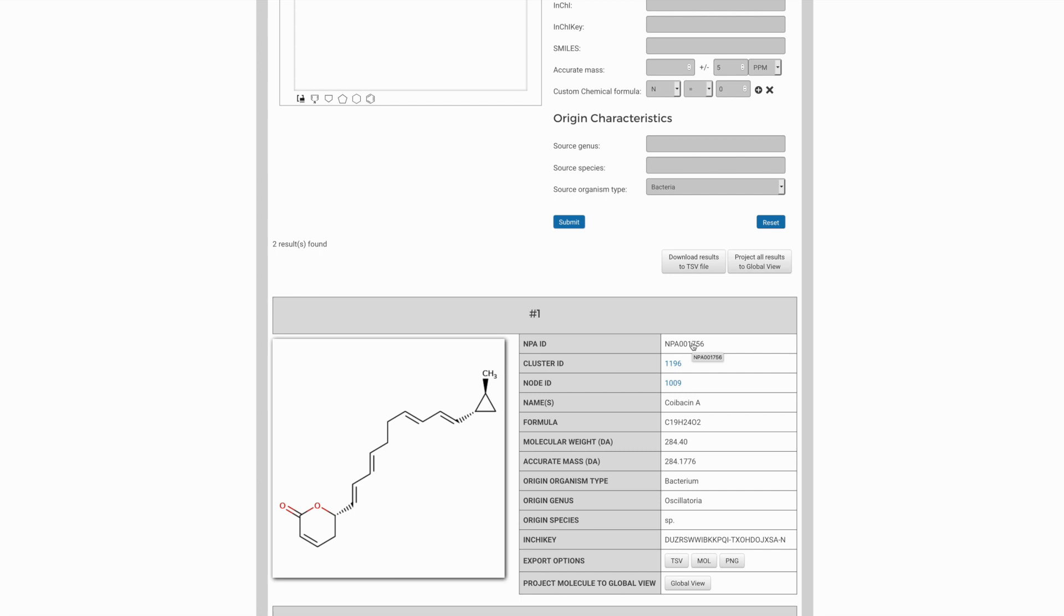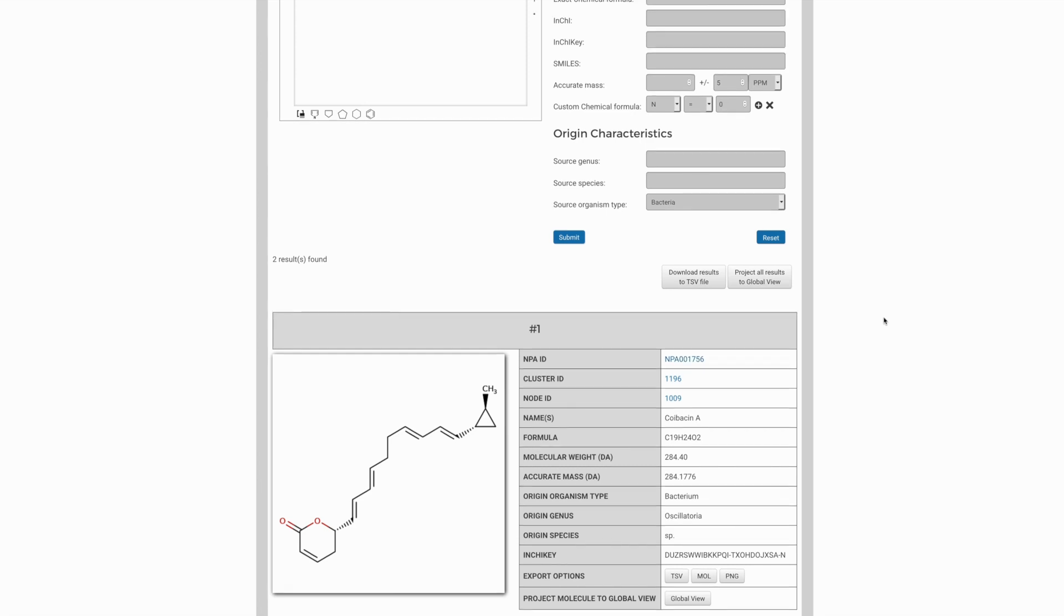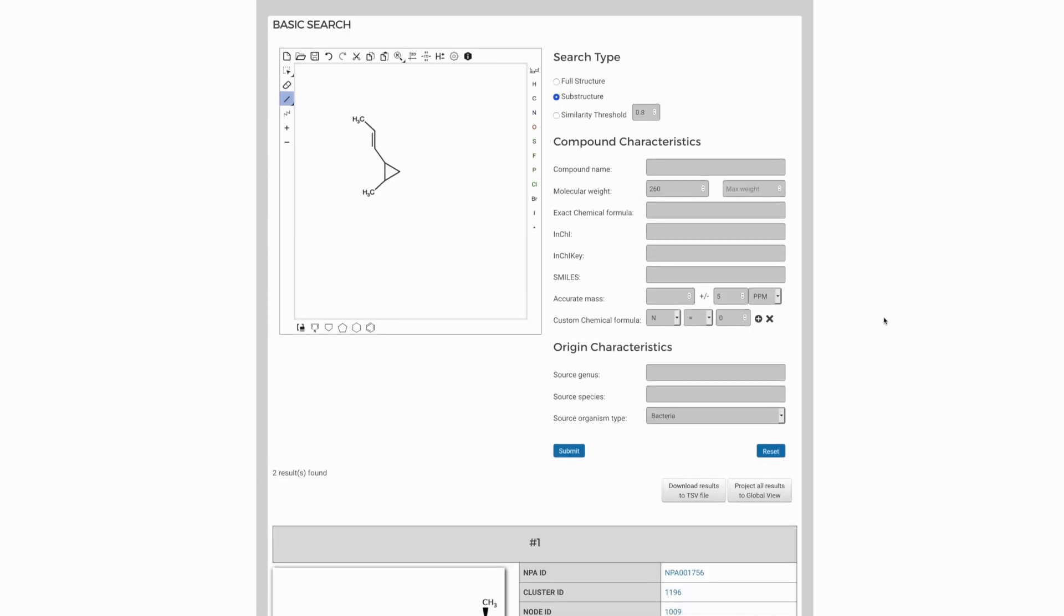It's, of course, not the only way you can explore these data. There are other options here, such as accurate mass, which you can apply as a lone filter if that's the only information you have, and a variety of other tools on the advanced search page as well.